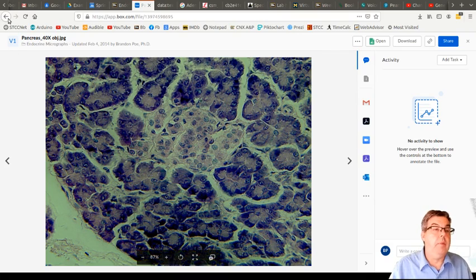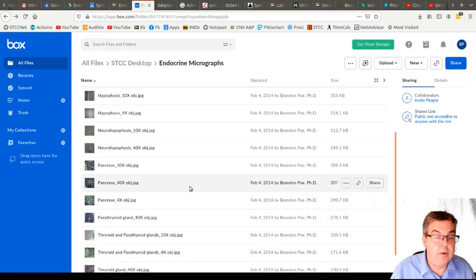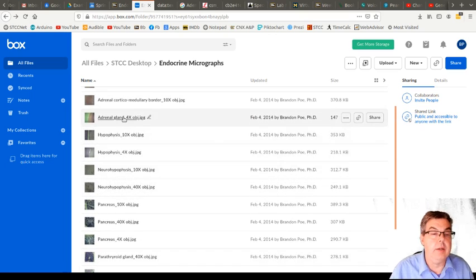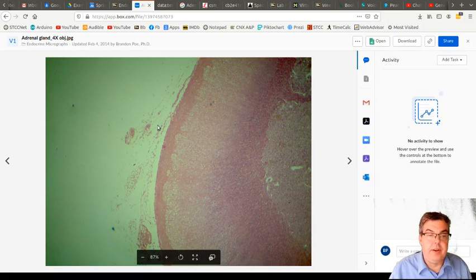So finally, the last part I want to talk about is, where'd it go? The adrenal gland. So this is clear glass here, so I could have taken a fuller frame picture of this, I suppose. But this is the adrenal gland. And the reason why I've taken it this way, actually, is this is basically the center of the gland. And we see layers of tissue as we progress out to the outside edge.